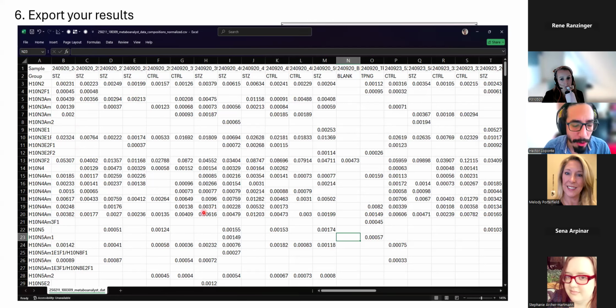This file can also be directly used on MetaboAnalyst, which can already do some grouped analysis on your sample. So you can quickly generate PCAs, heat maps of your identifications. You can do t-tests or ANOVAs of your samples and try to find out if any specific glycans, for example, might have already given you a significant different value, for example.